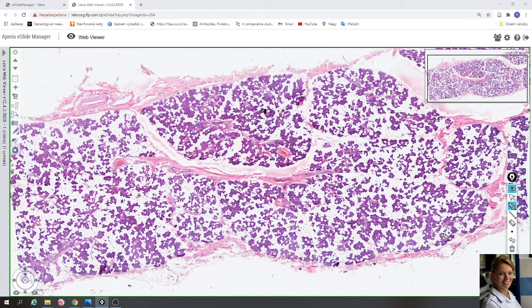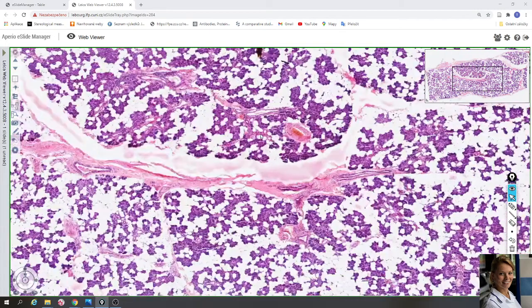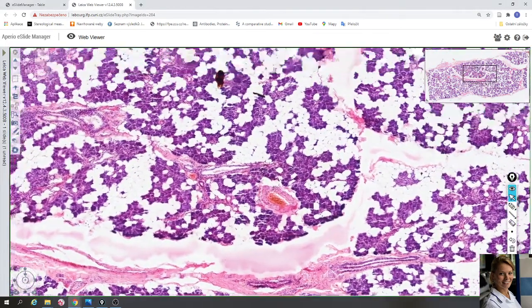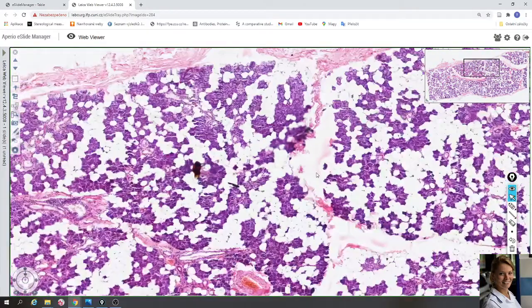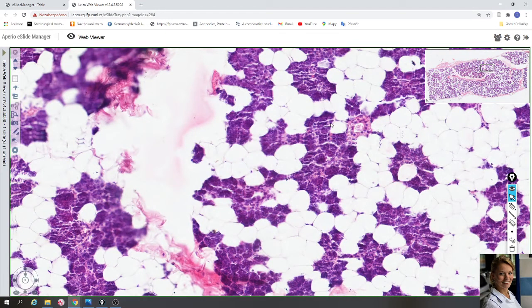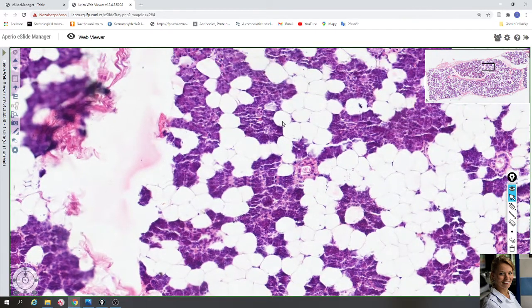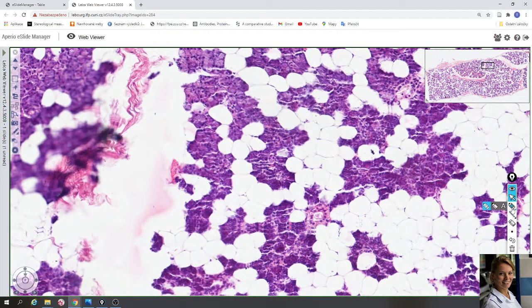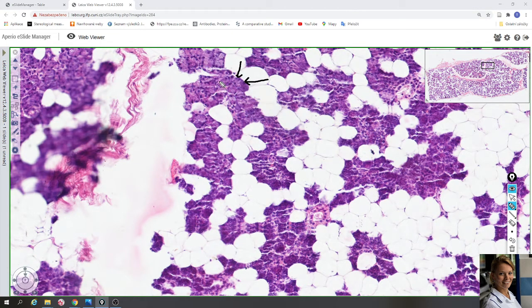Each salivary gland consists of secretory cells. Here you can see acinar cells; the spherical nuclei of these cells are located in the base of the cell. Here the nuclei and the pyramidal shape of the acinar cells are clearly visible. The pyramidal-shaped acinar cells are arranged to form the acinus.